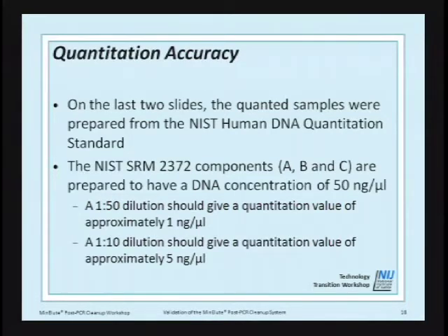I think it's about $1 a microliter is what it works out to be, because it's like 3 tubes at 110 microliters, and it's $330 something for those 3 tubes. So it's about $1 a microliter for your NIST quantitation standards. So obviously, using that as your quantitation curve, I think it's going to raise the cost of DNA testing quite high real quick.